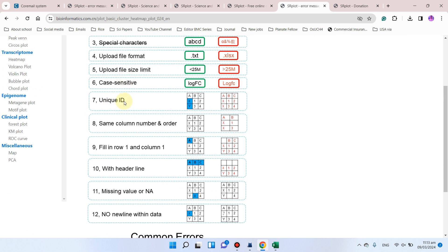Another important thing: use unique IDs. If your data has 'X' repeated in a group, it will give an error. The correct way is to use different names — for example, the first one is X and the next is Y. The column order should be A, B, C, then X, Y — this is correct, but if X is repeated it will cause an error. Also, make sure the first row and first column cell is not empty — it must be filled with something, otherwise it will also give an error.